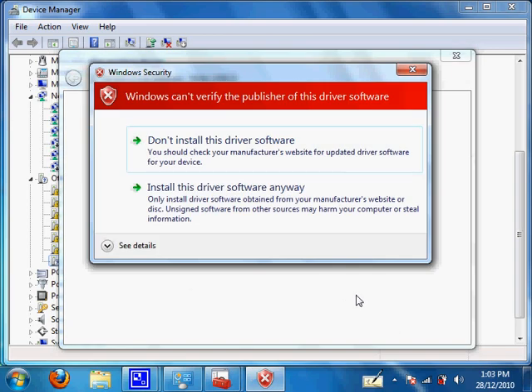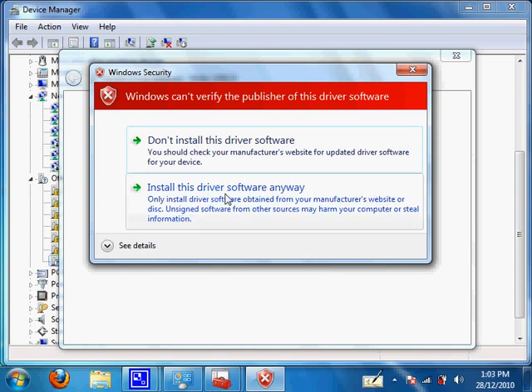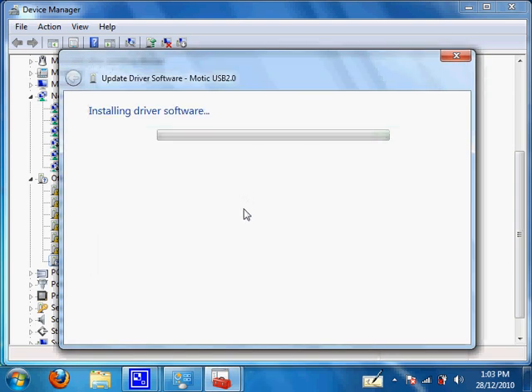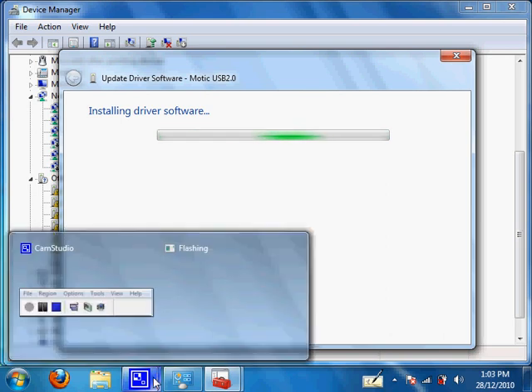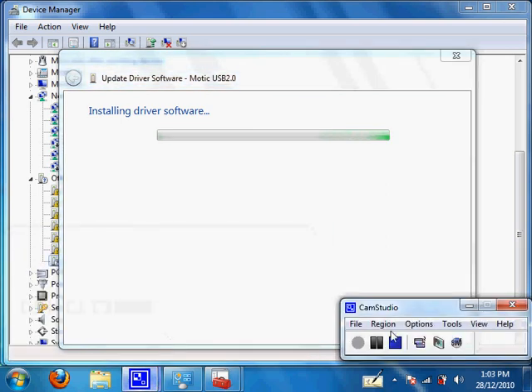Windows will warn you that this software is not digitally signed. I can assure you there's nothing wrong with the driver. Just click on Install this driver software anyways. For efficiency purposes, I will now pause the video.